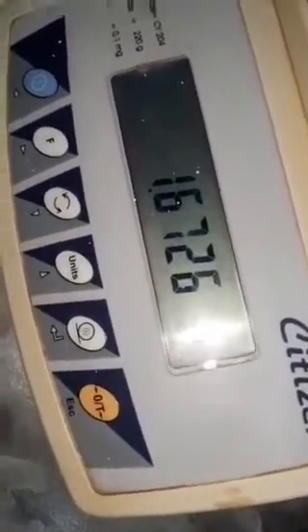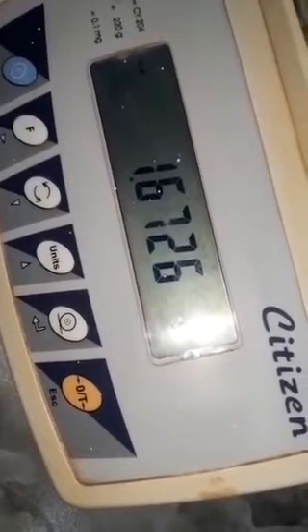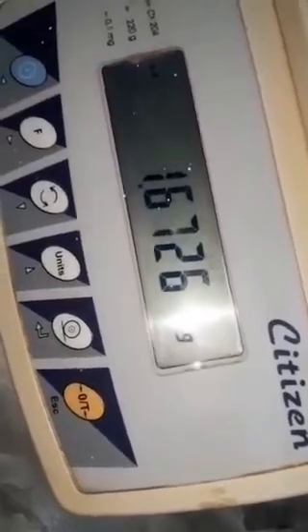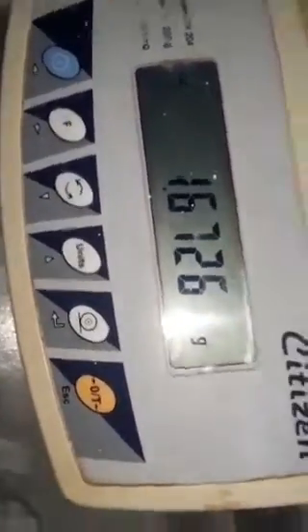We'll record the mass of the tablets, which is 1.6726 grams.